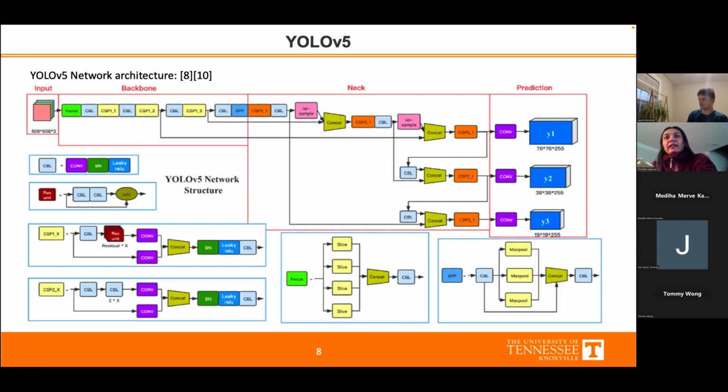Now, directly these 3 YOLO prediction heads that you see predict your final predictions of the boxes. Everything about the objectness score and class confidence score is happening there. Now, we know about these extreme layers: in the backbone, we are simply converting our image into a low resolution image, and in prediction, we are simply applying these probability functions and getting the predictions out.